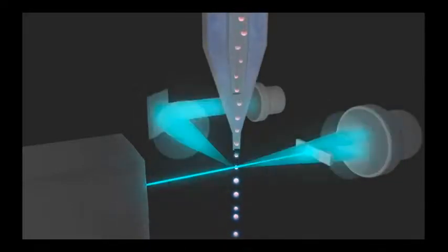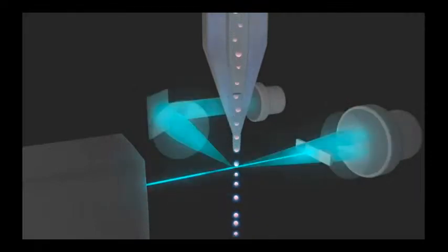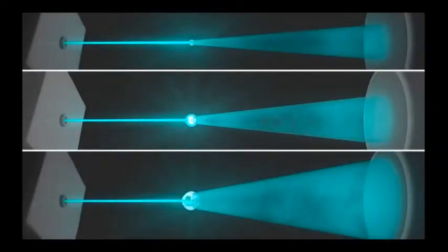Each cell within the sample then moves across the laser beam, allowing each cell within the sample to be individually analyzed. As each cell passes through the laser beam, it will scatter light in multiple directions. The flow cytometer detects light scattered in a forward manner, called forward scatter, and light scattered in a sideways manner, called side scatter. The amount of forward scattered light for each cell is detected by a detector on the far side of the cell from the laser.